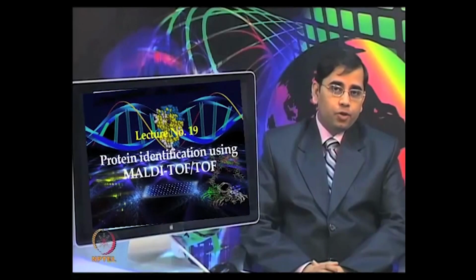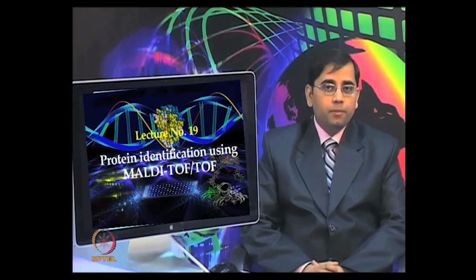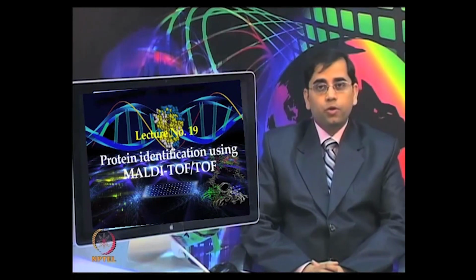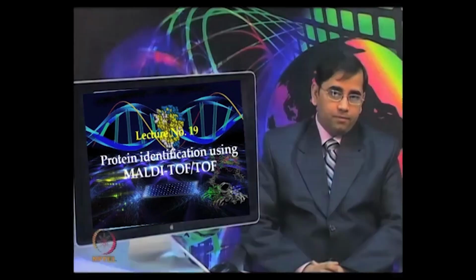So, today let us focus on the MALDI-TOF, which is one of the very widely used technique in proteomics. This provides a high throughput platform for several applications, including molecular weight determination, protein identification, as well as post translational modification studies.